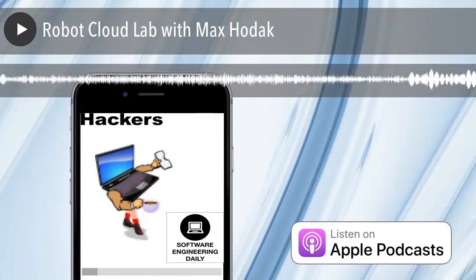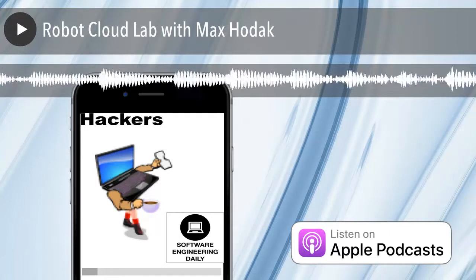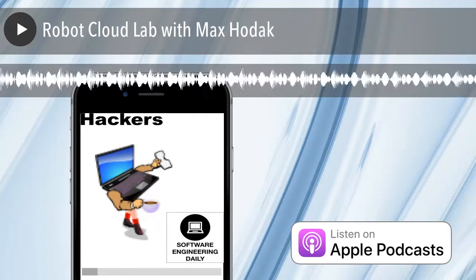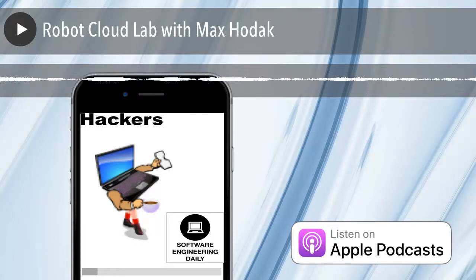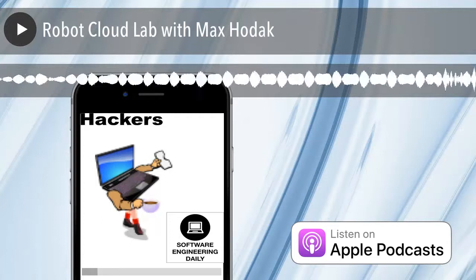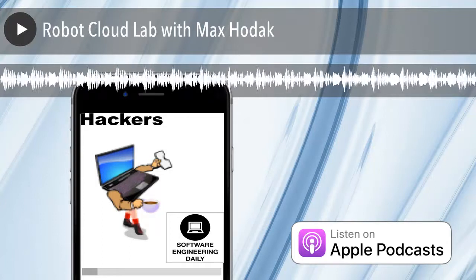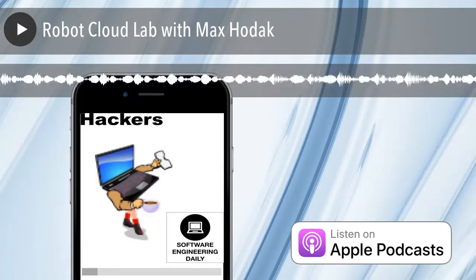So PCR will let you do that. It'll make billions and billions of copies of a piece of target DNA. PCR is a well-defined task, but it is mostly done by humans today. Why is PCR a good candidate for automation?